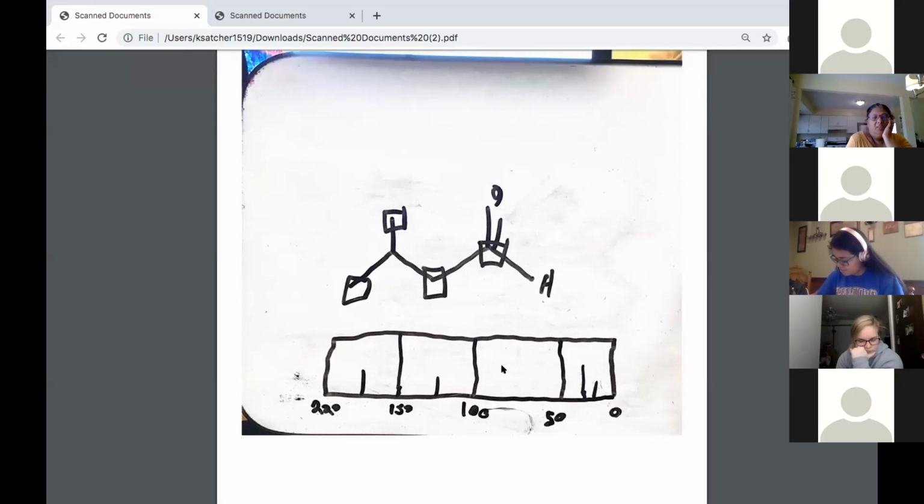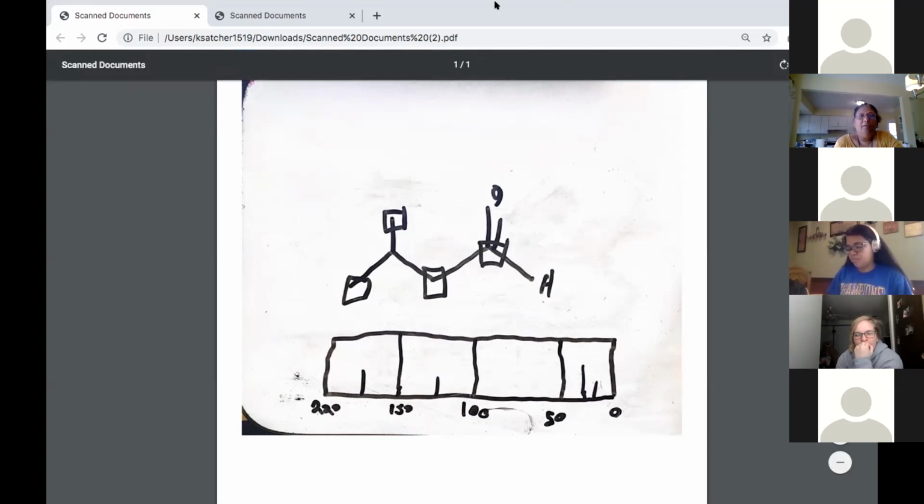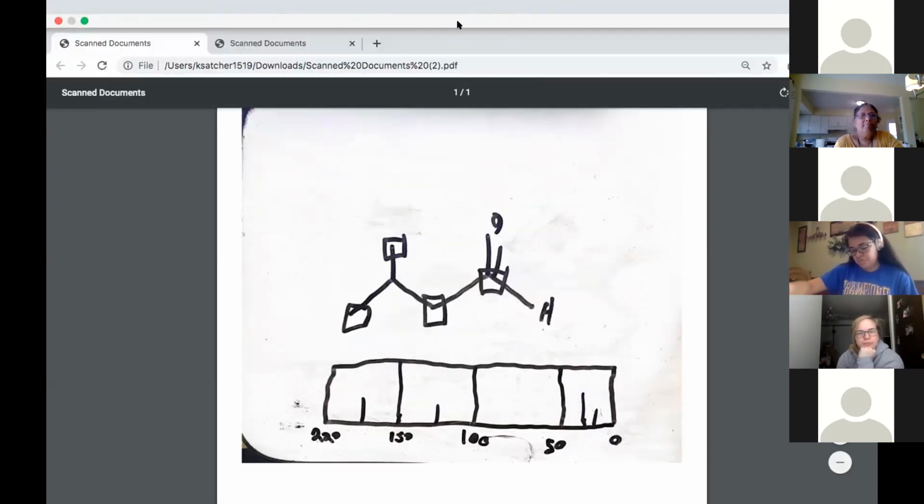Can you all see why it should come between 50 and 100? Why are the methyls between 0 and 50? Can you all explain, everybody? Pull up your chart. Can you go back to the chart, AJ? Yeah, I got you. Hold on, let me stop share.